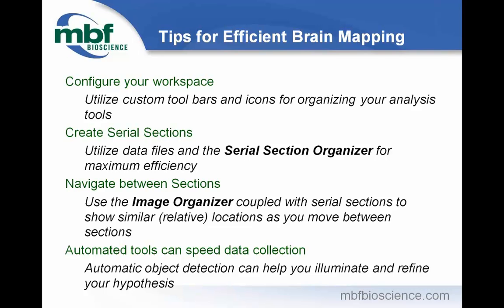One other thing that I want to make sure to highlight is the topic of an upcoming webinar, which is Biolucida Cloud. That's a new product from MBF Bioscience, which allows you to share image data with your colleagues by putting the image data in one central location. And where would that be? Wherever you have your Biolucida Cloud server set up.